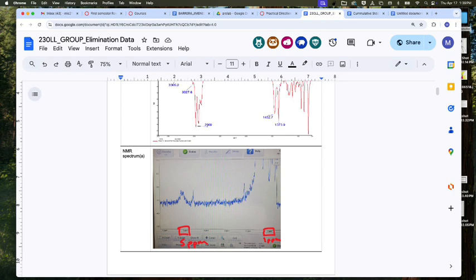That's how we'd have to get it off. Even if we got the NMR spectra off, the next problem is it's in a file that is only interpretable by certain software. That software costs thousands of dollars, so you don't have a way of doing it either. All the interpretation has to happen on the instrument, which leaves you out of the picture and leaves it to me.